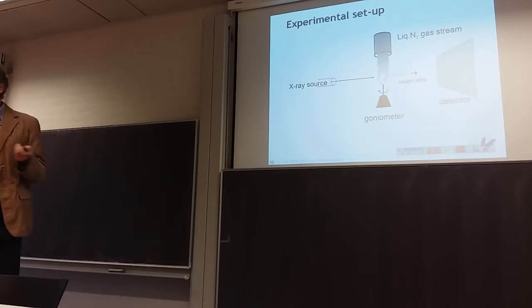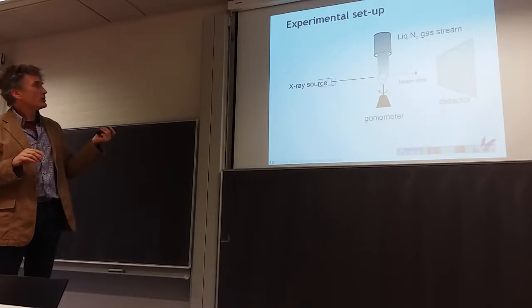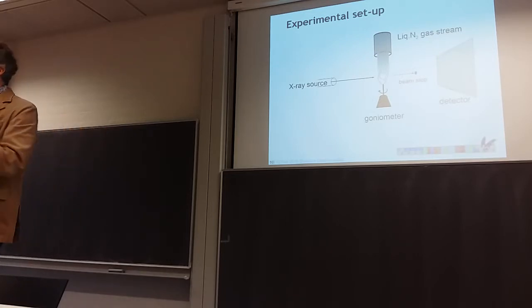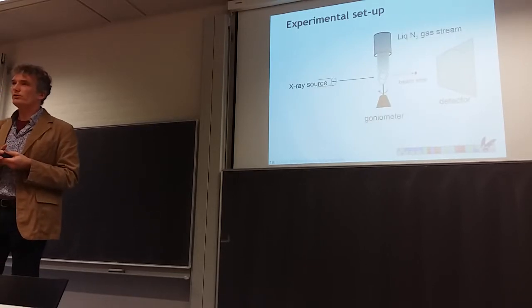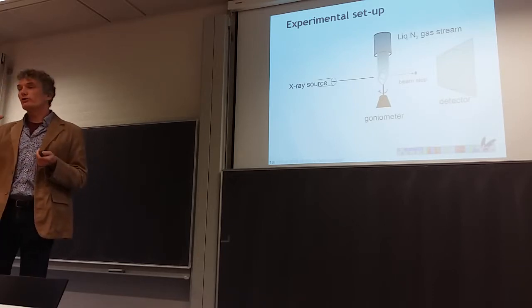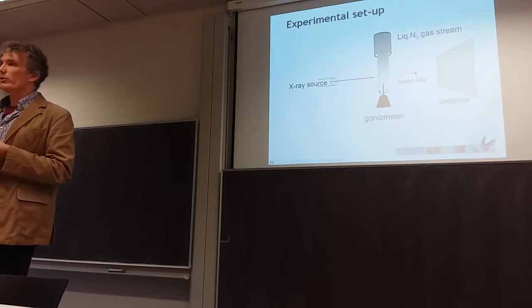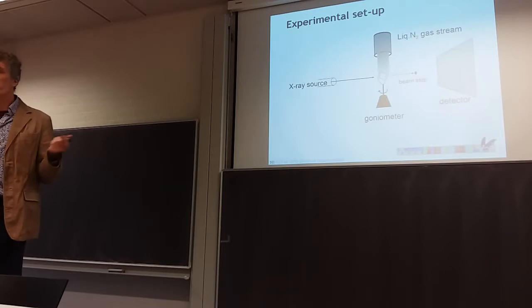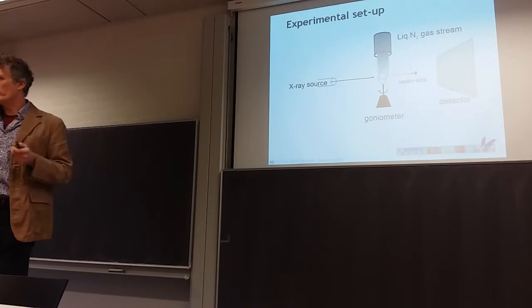There's liquid nitrogen to keep it cool, for different reasons. One of them is because you're going to shoot X-rays onto your crystal, which are typically energetic, so it will actually heat up your crystal. You want to get rid of that heat before your proteins and your water start evaporating. The other thing is that if you want a high resolution structure of your protein, you need to dampen the atomic motions. If you don't go to liquid nitrogen temperature, like if you do it at room temperature, you're stuck at about 3.5 angstrom resolution because the atoms are moving too much.